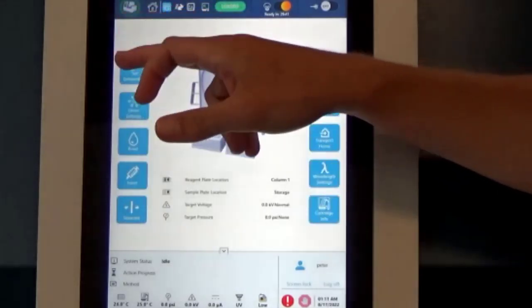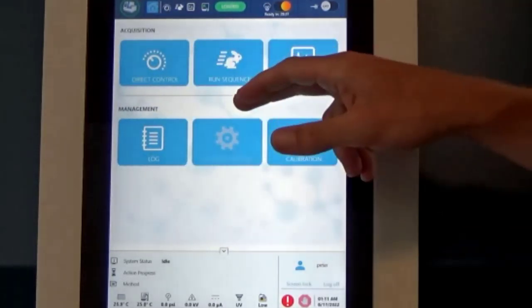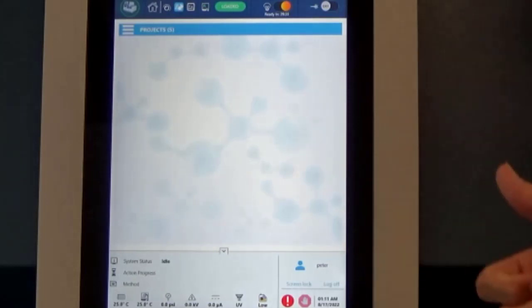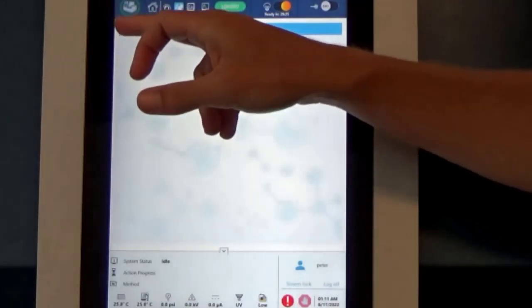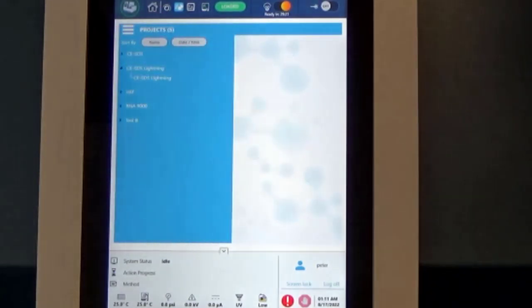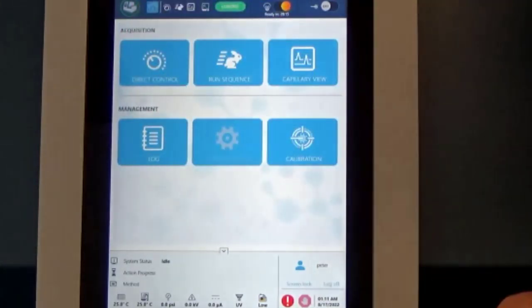If we go back to our home screen, we have a few different tiles down here. Our next one is our run sequence tile. When we create a sequence on our BioPhase computer that's sitting next to the instrument here, and we save that in a certain project folder, you can just navigate right to there when we're ready to start our run. We'll be doing that a little later today.